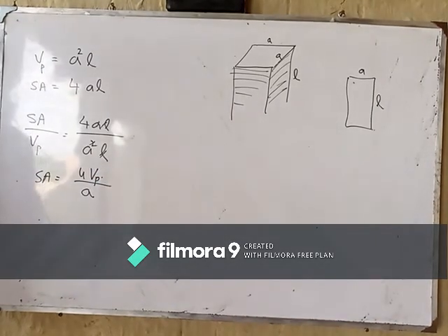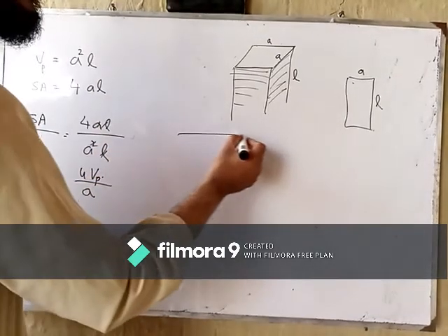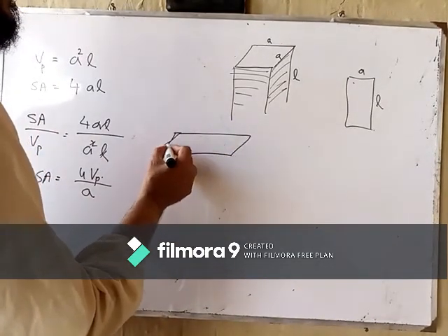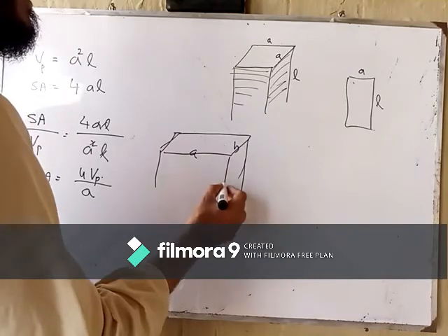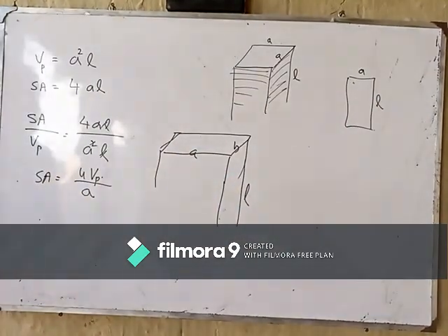So it shows that surface area is related to size of the pores. इसी तरह रेक्टेंगल के लिए, अगर पोर इस तरह के हैं, ये a है, ये b है, और ये लेंथ है, तो ये आप खुद कैलकुलेट कर लें. देखिए इसके लिए सरफेस एरिया साइज के साथ किस तरह रिलेटेड है.